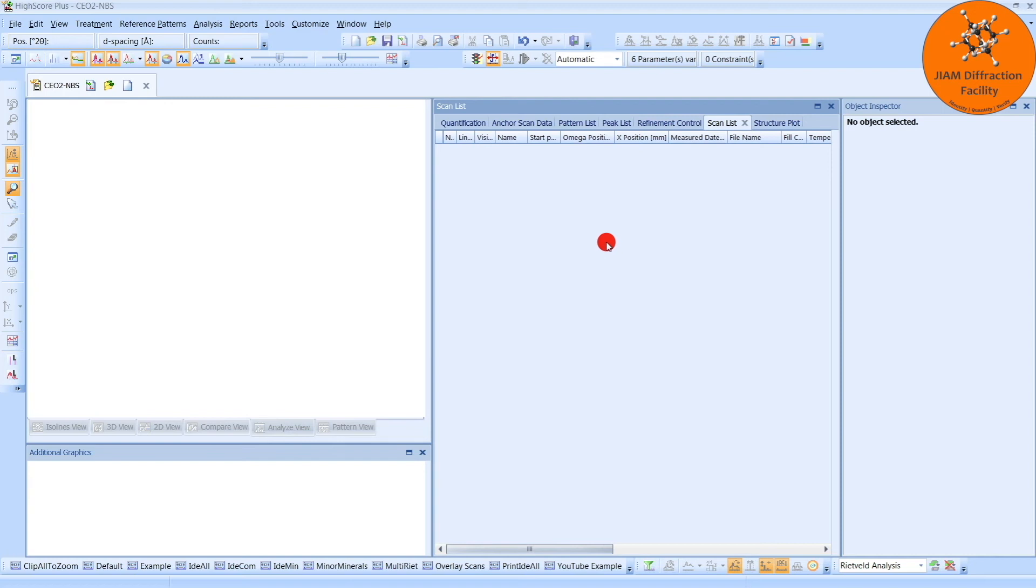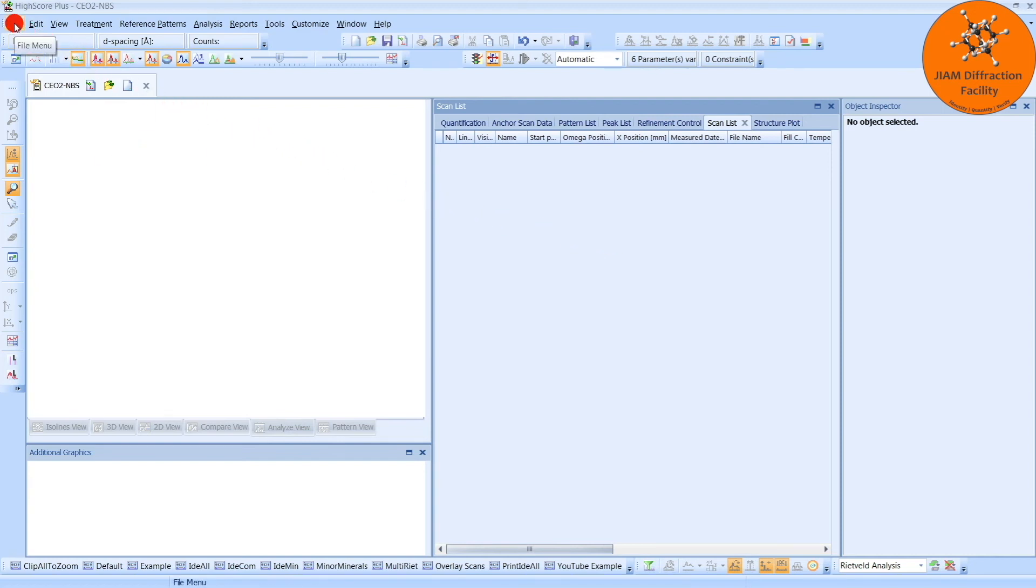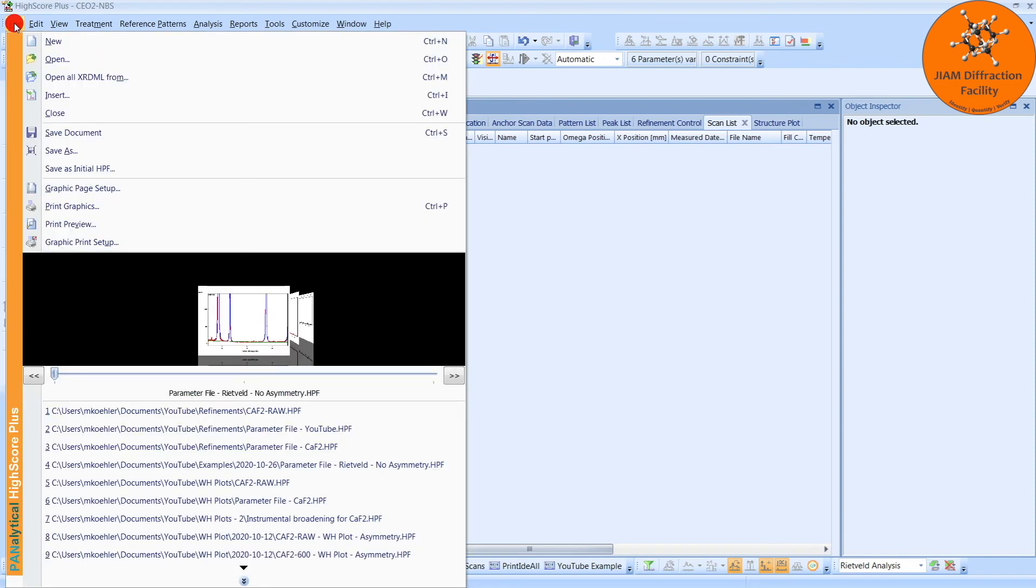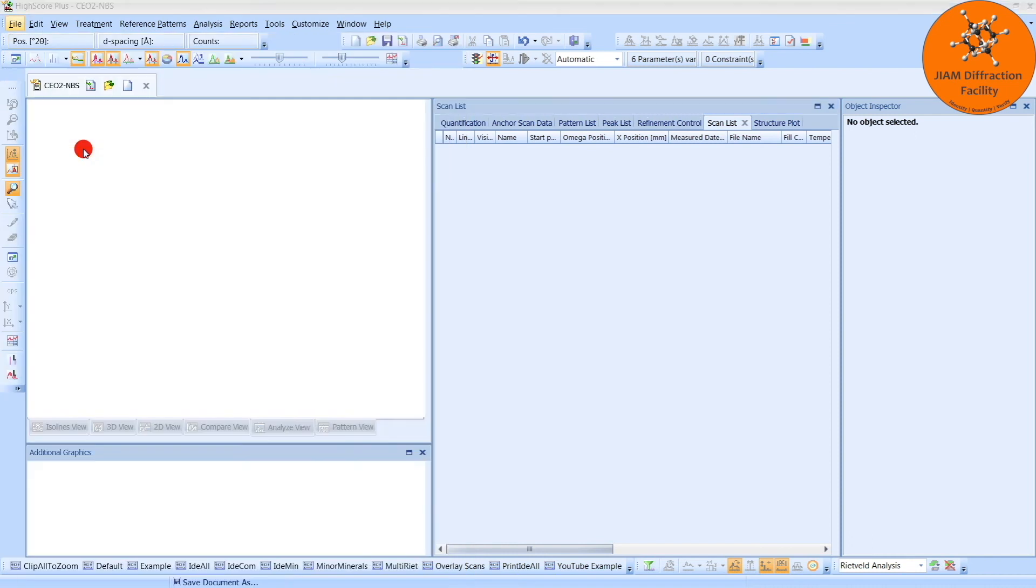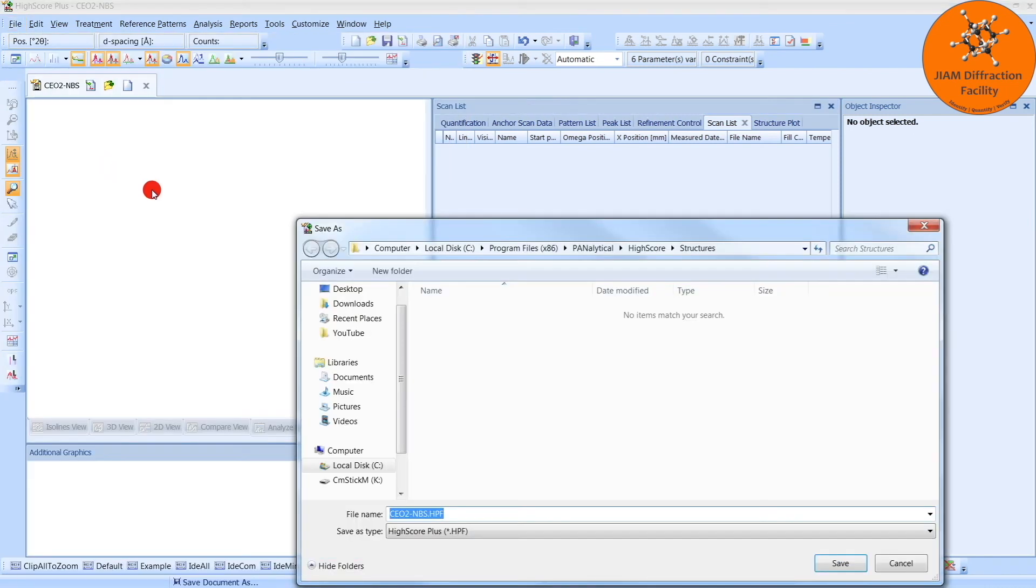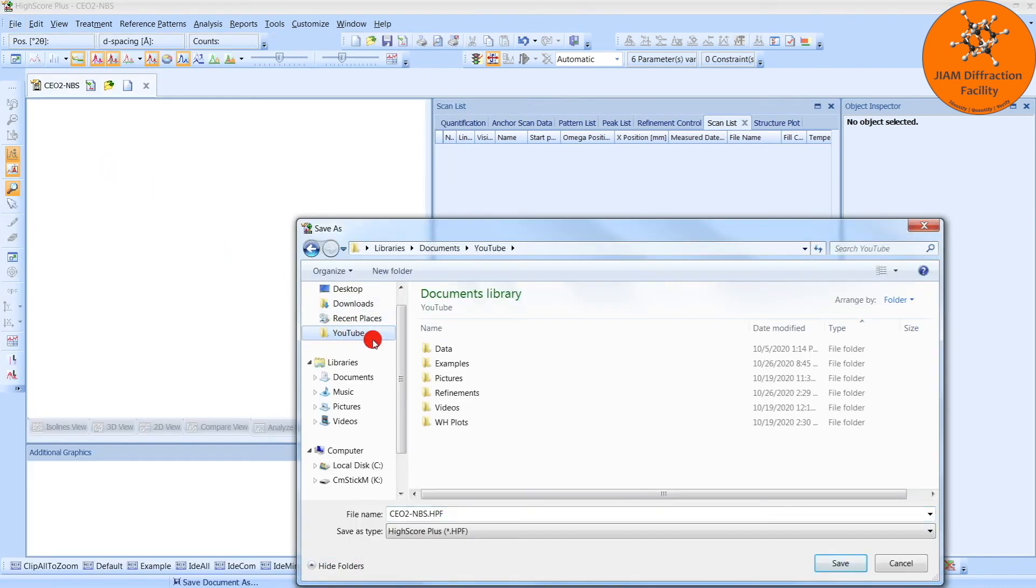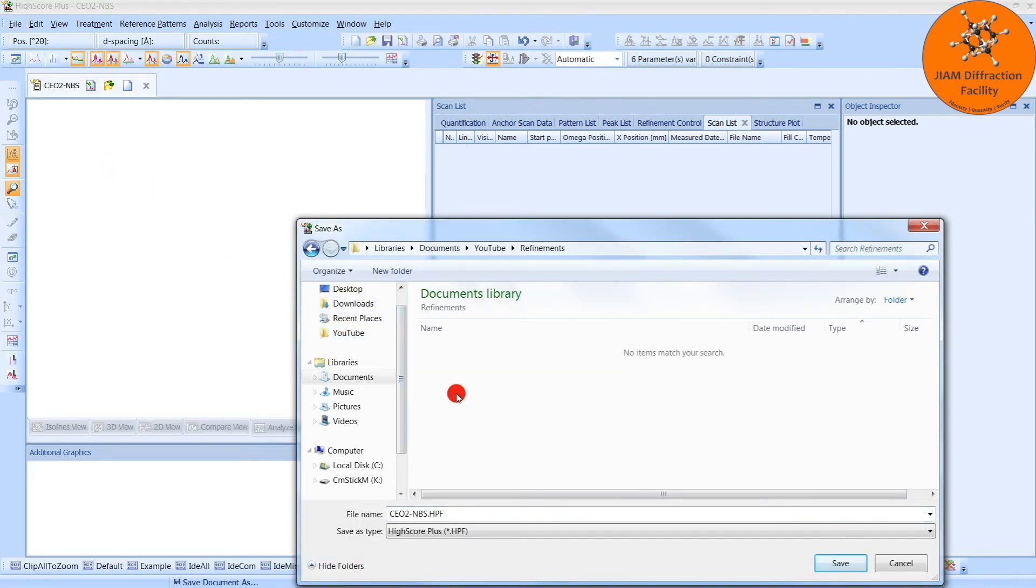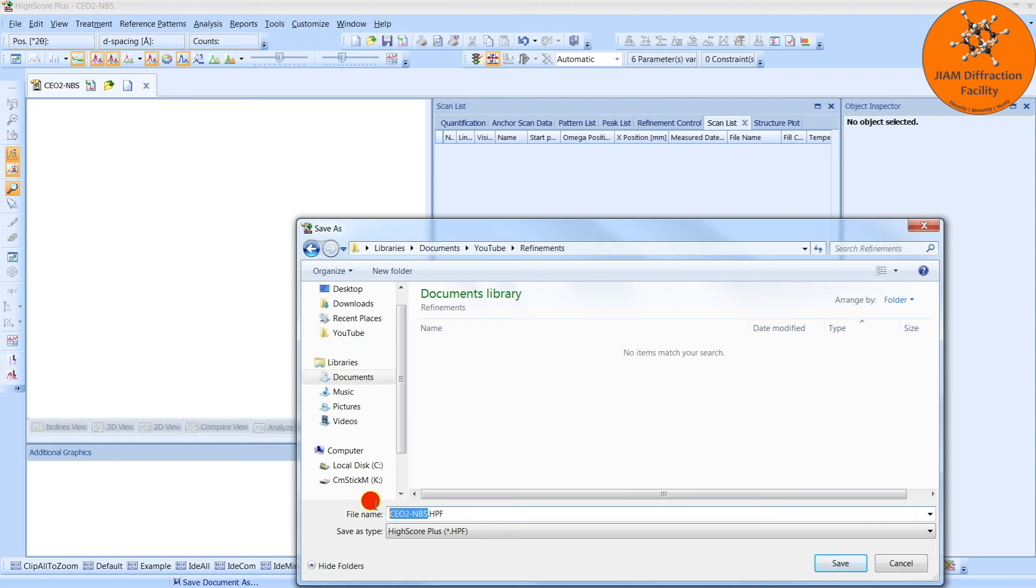So we want to save this file so that we can then insert our multiple other files one by one in order to analyze them. So we go to File, Save As. I will go to my YouTube and Refinement folder, but you can save yours wherever you like.